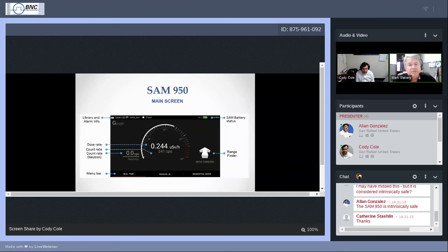In the center of that, the largest set of numbers is the dose rate, and this will constantly be fluctuating, probably on the average of every second, because that's how regularly we update the monitoring. Every second, you may see that change, and you'll see that it fluctuates because that is the nature of radioactive energy. It's not just this constant beam that's always being shot out like a laser. Radioactivity is always in flux or fluctuation. So you'll see that move around.